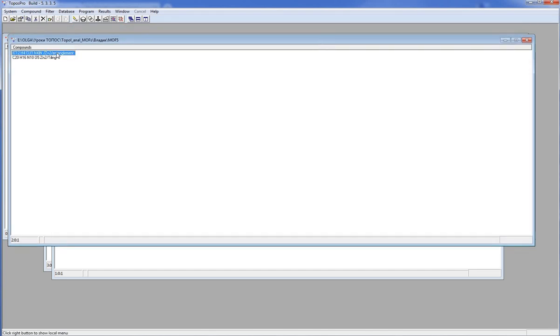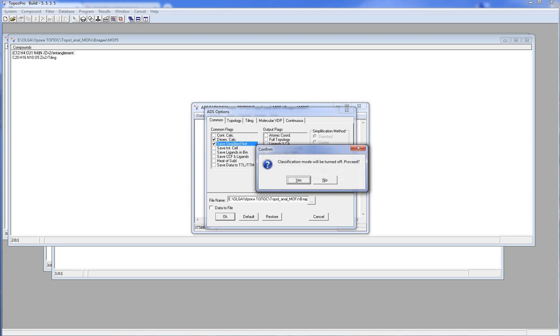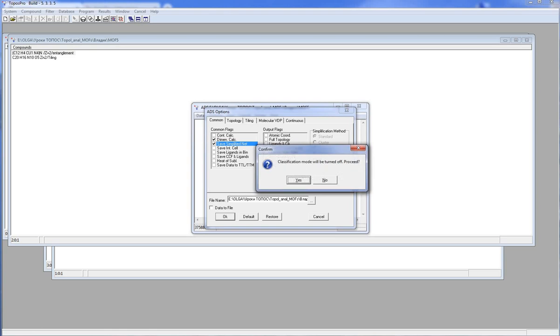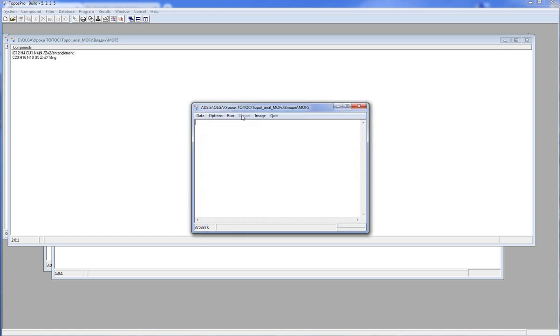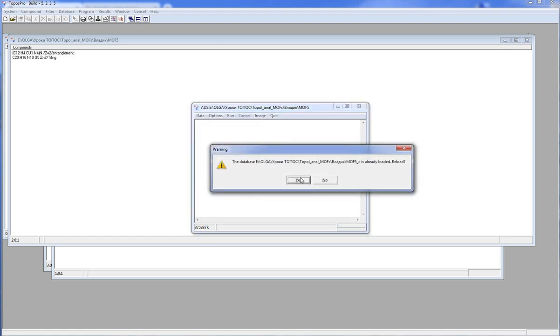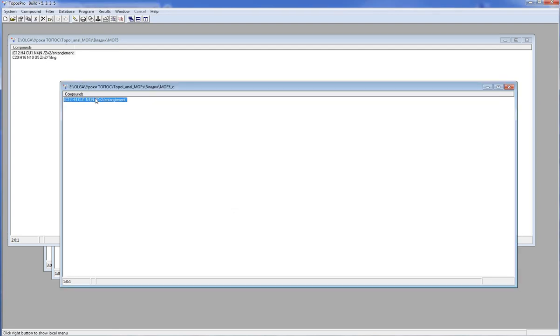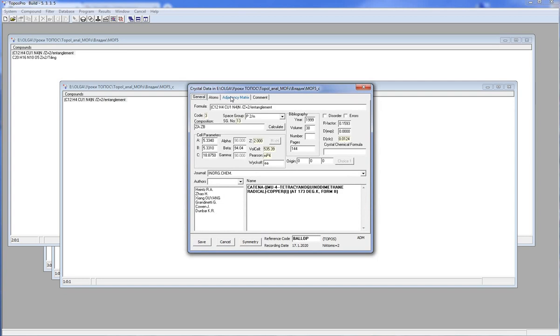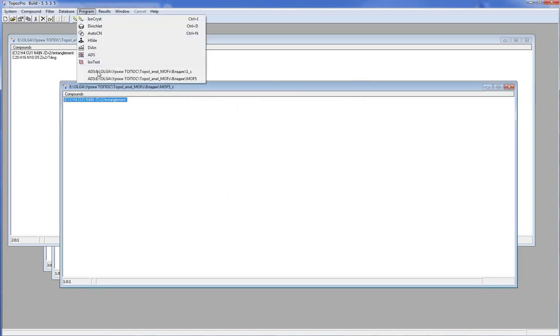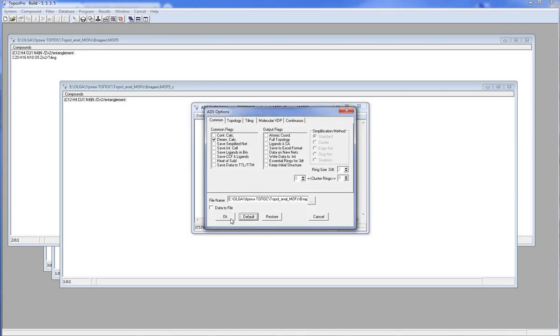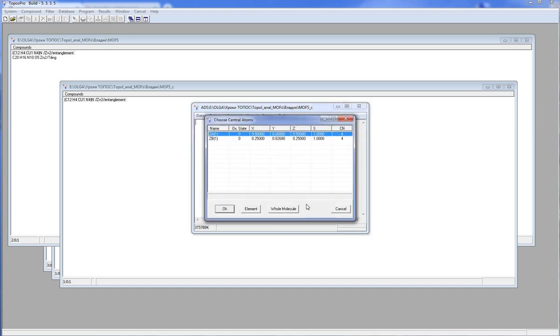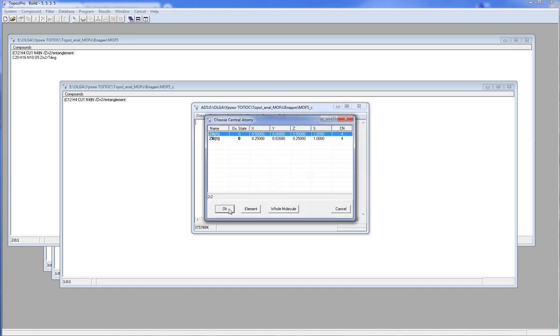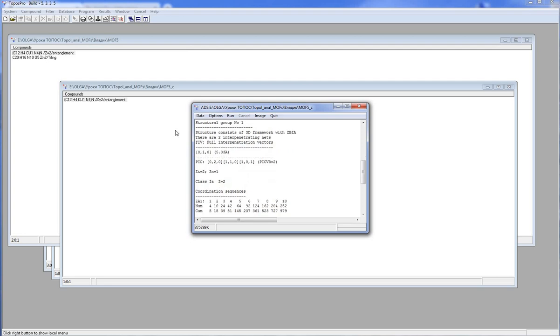Topos Pro also enables you to find interpenetrations in the MOF structure. To do it, you should simplify the structure and classify the underlying net.